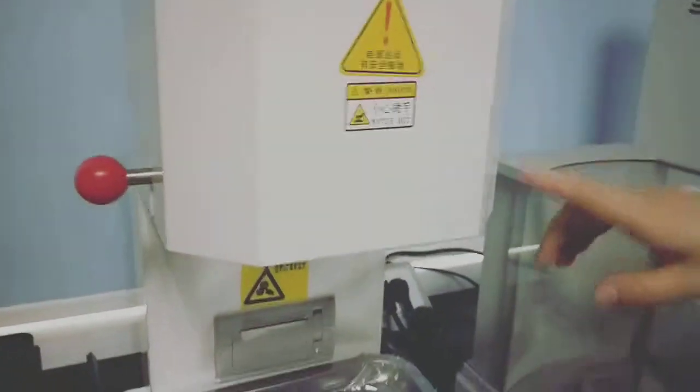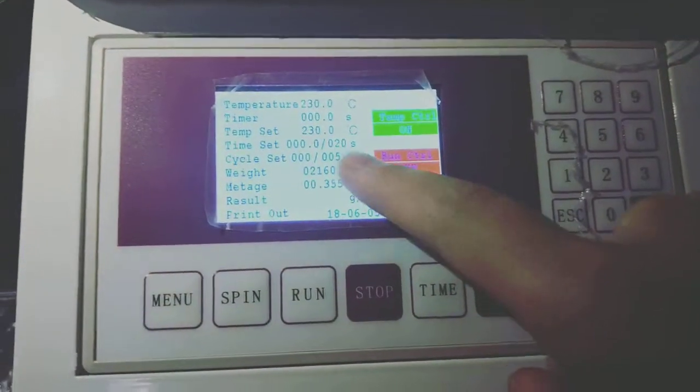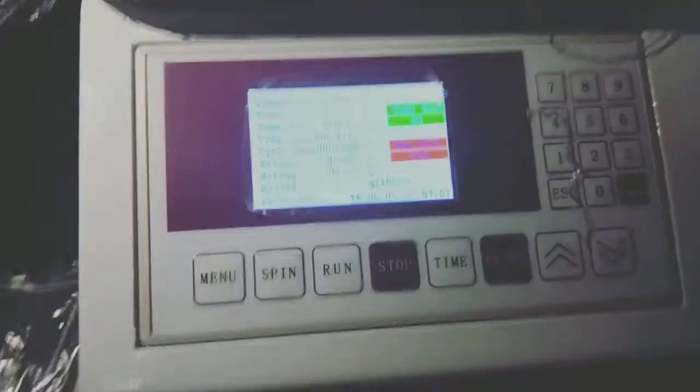As we can see, the extrusion speed is slow. Then we can change the cut time to 20 seconds every piece. It means automatically cut one piece every 20 seconds.